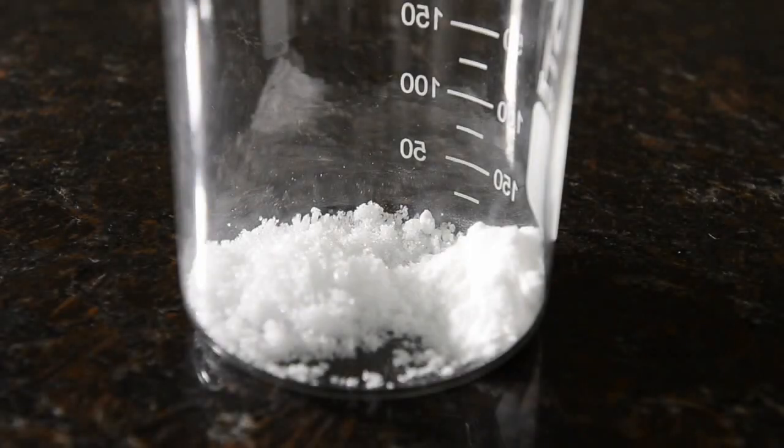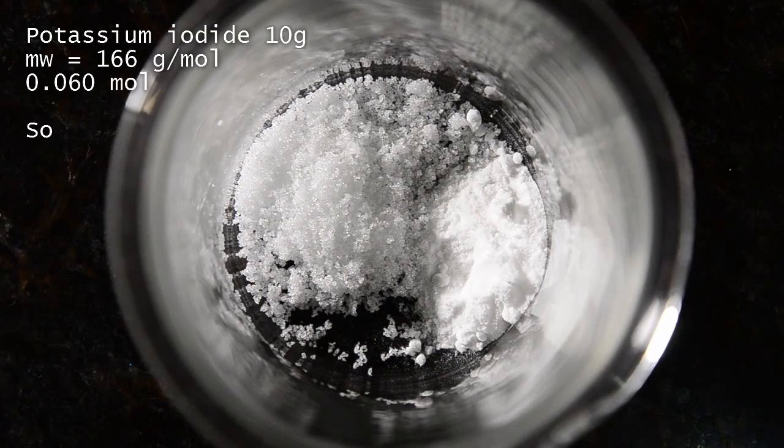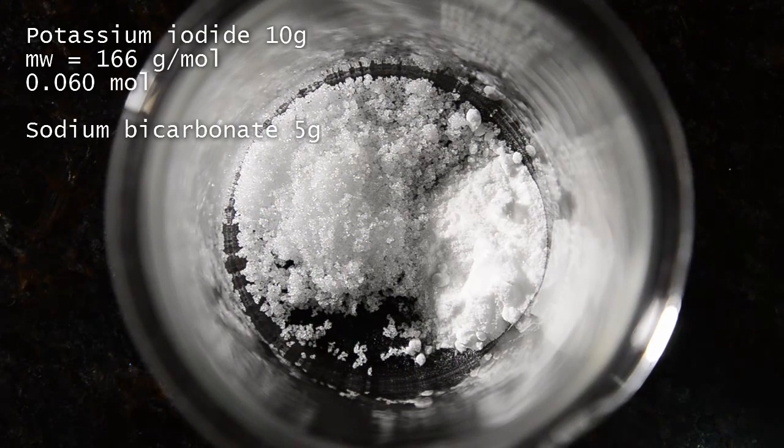We are going to be preparing 5-iodovanillin. There are a few ways to do this reaction, and we're using the exact method from JCS 37401958. First, we start by weighing out 10 grams of potassium iodide and 5 grams of sodium bicarbonate into a beaker.